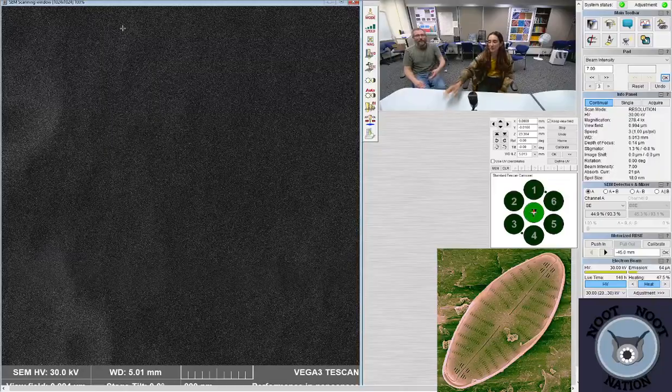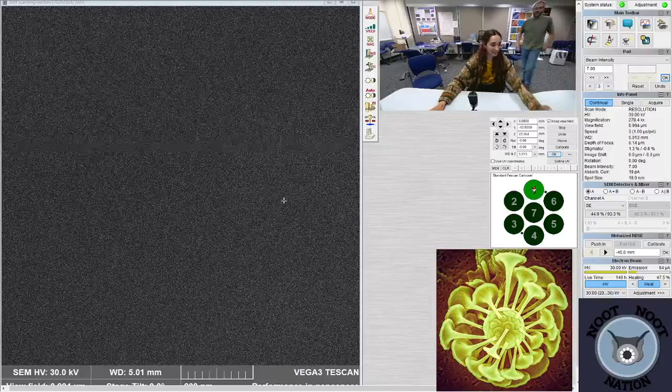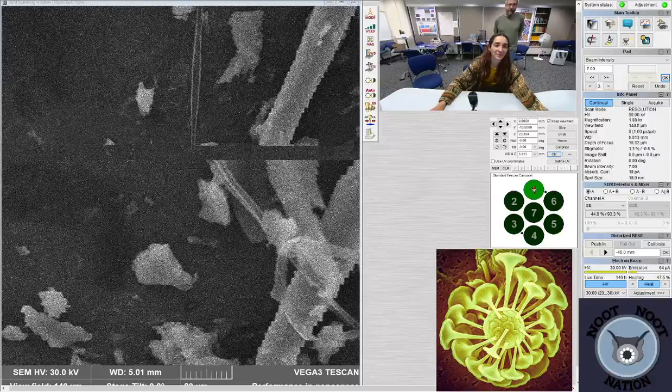I'm going to go to number one. Yeah, you've been on sample 7 and 3. Today's number one. Yes, but I'm not seeing anything. You probably need to zoom out because you're super close. Yeah. And just look around and try to find something good. And then I'll be back in like 1 minute.